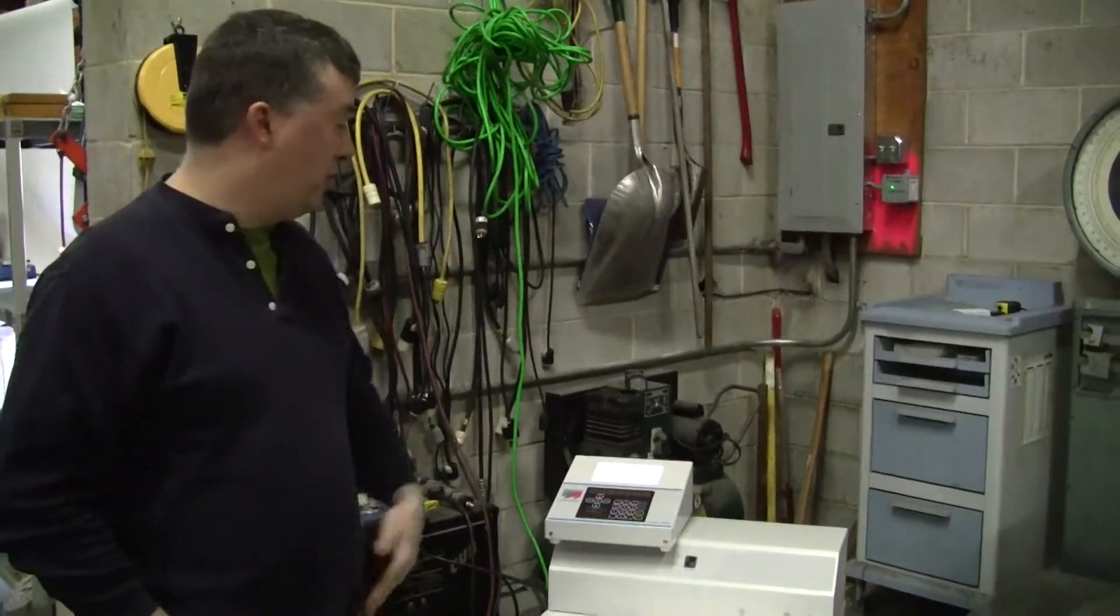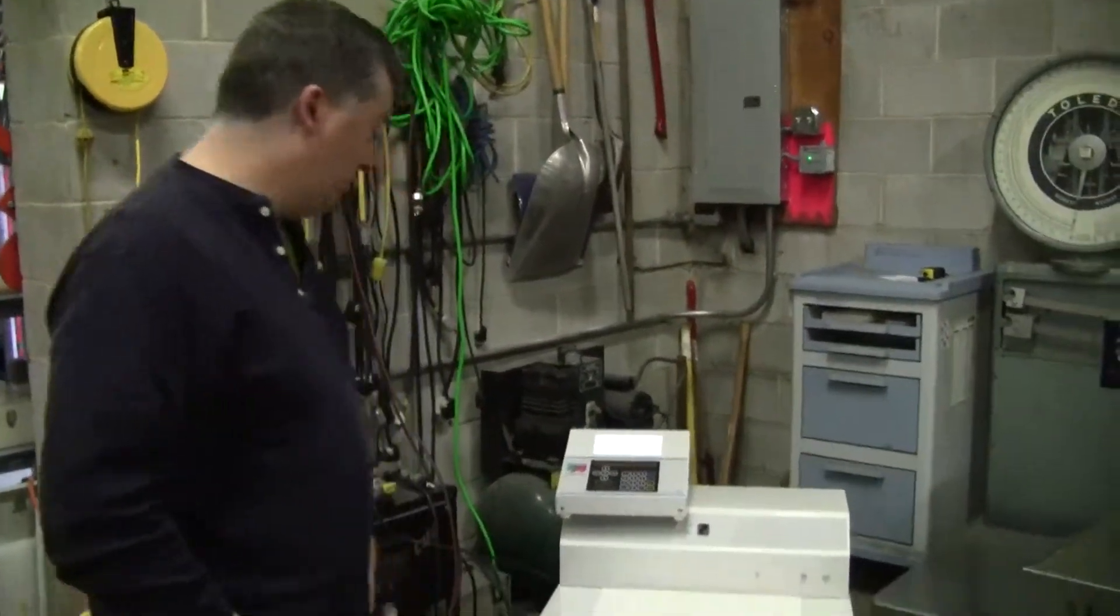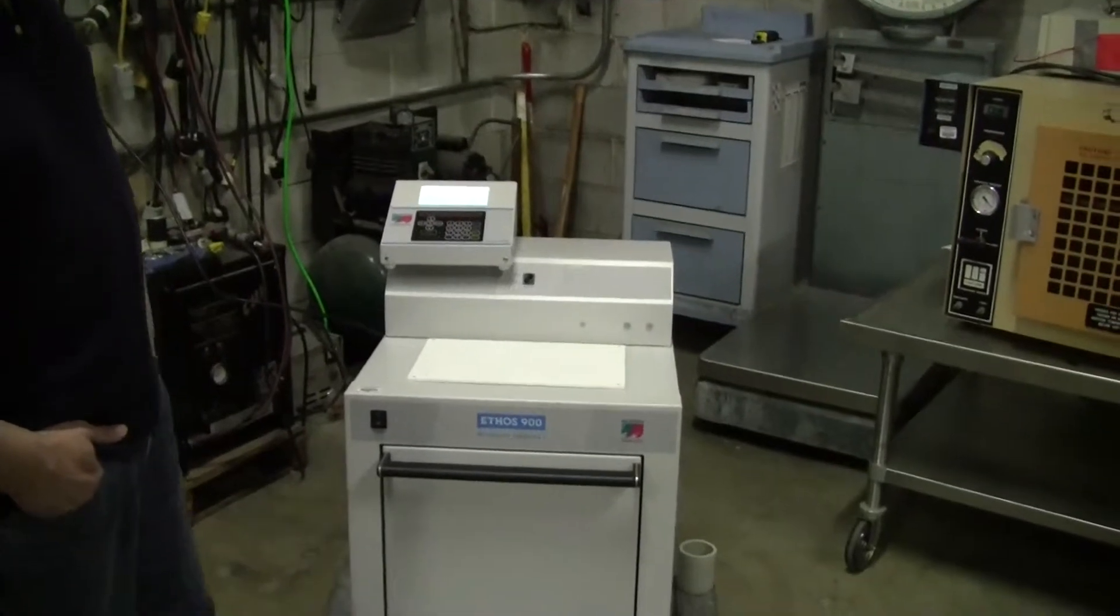Hi, this is Michael Nytao from Hitech Trader. Today we're looking at an Ethos Milestone 900.